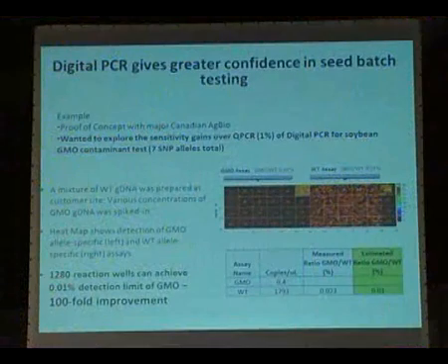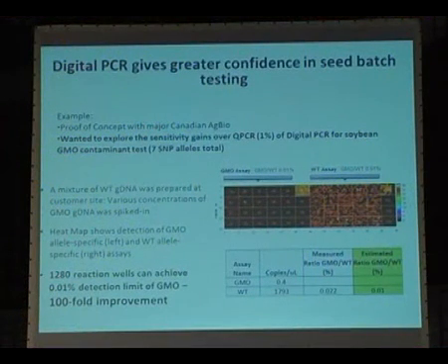And what this image behind me shows is the actual raw data from the Open Array plate. Where you see those little red squares, that's a positive amplification, and the black squares are where there's negative amplification. On the left side of the plate is where we spiked in the GMO targets at 0.01% and tested those using an assay specific to the GMO alleles.